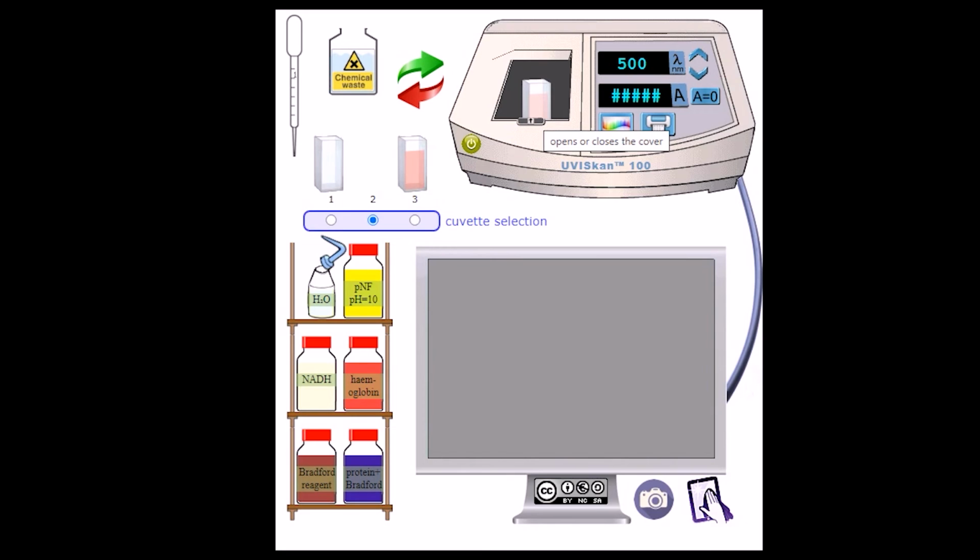We are going to close the door, and the absorbance is 0.126. And we're going to open, and take out the cuvette. Now we're going to put in the solution that is more concentrated, so we expect to get more absorbance than the two others we got.